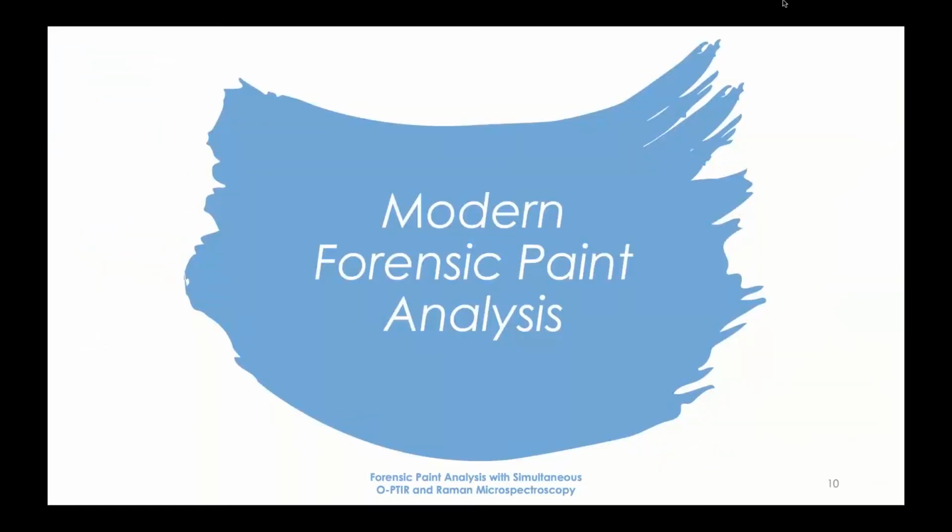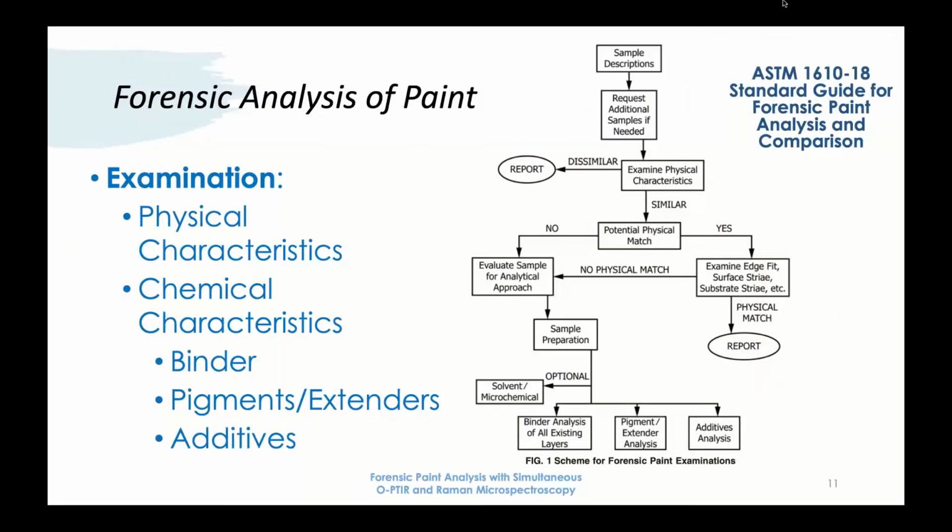So, modern forensic paint analysis. Well, ASTM 1610 provides the standard guide for forensic paint analysis and comparison. This includes the examination of both physical and chemical characteristics.